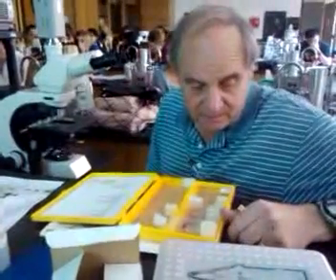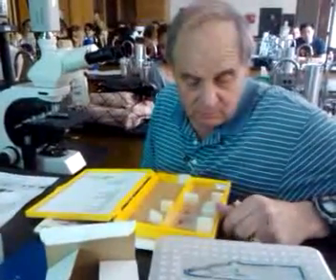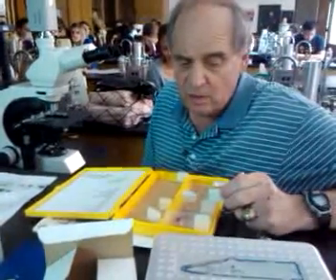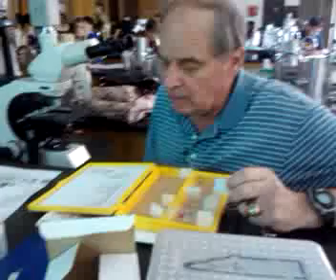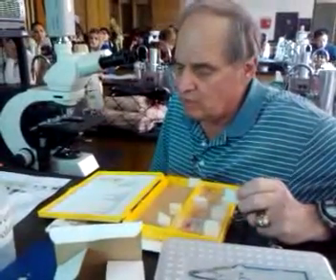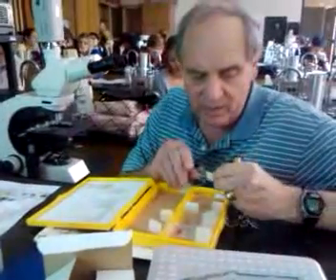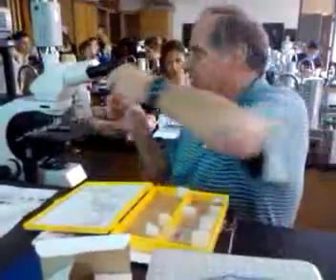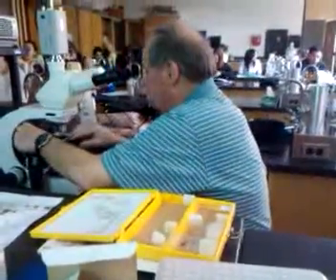Let me see. That stuff will be on the test too? The inactive mammary gland? I know what we ought to do first. Since we looked at the ovary, we've got one of the. Well, we can come back and do the mammary gland. Wait, here's a mammary right here. Just a minute. Here's an inactive mammary gland right here.